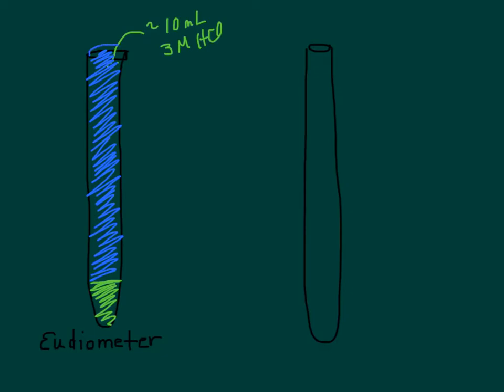You're going to fill it so that it's actually got a little bubble — filling it to the brim, really to overflowing. Try not to mix the HCl and water. Then insert your rubber stopper into the eudiometer pretty firmly but not too tightly — you don't want to break it. Some water will spill out over the edges. Stick the rubber stopper in so that the coil of copper and the magnesium are inside the water.